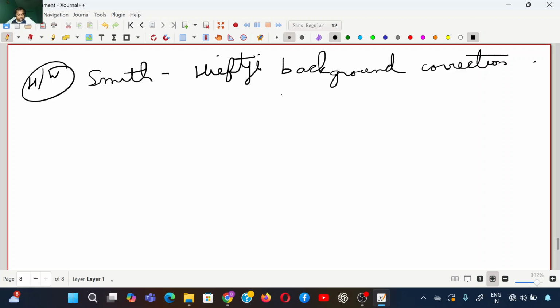So there are some practical considerations in AAS. You always prefer nitrate salts over chlorides or sulfates for standards. Avoid acids that can form interfering species in the flame. You have to optimize the flame also: optimize the burner height, aspiration rate, etc. That's it for today. I'll end the class.